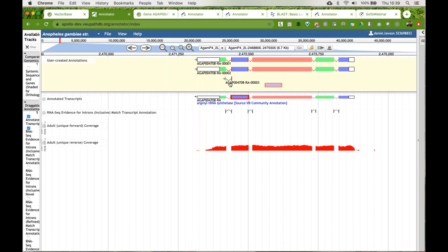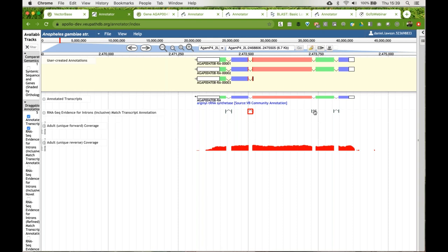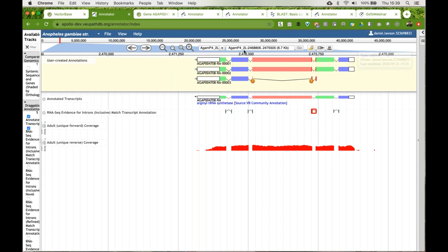You can add exons by highlighting an exon, lifting it up into the user-created area, and as long as you're hovering over the gene you want to add it to, a green box appears. When you let go, the model will be changed. You can take an exon and add it to the gene just by highlighting, hovering over, and letting go. You can also do this by taking introns and adding them in the same way.